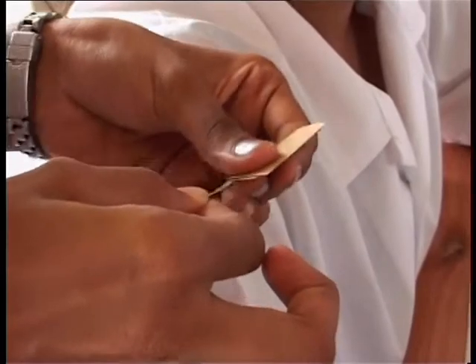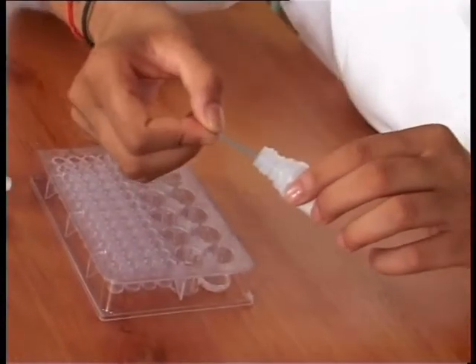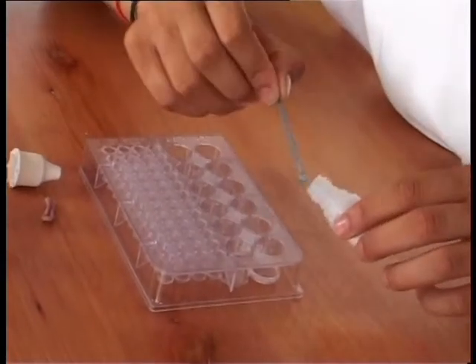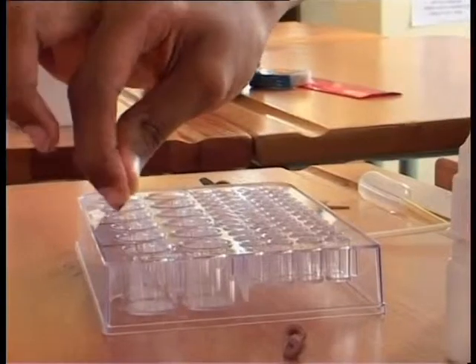Sandpaper the magnesium ribbon until it is shiny. See bubbles. Put 3 microspatulas of substance A or B or C into well F2. Push the piece of magnesium ribbon into the powder. Yes, but there was no smell and there were no bubbles inside, so no gas is produced.